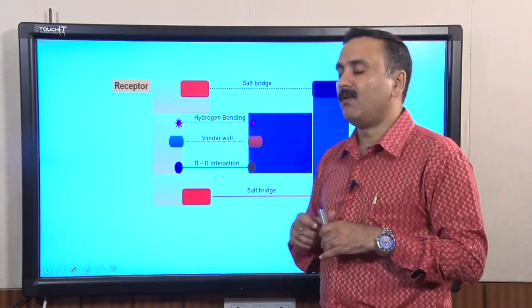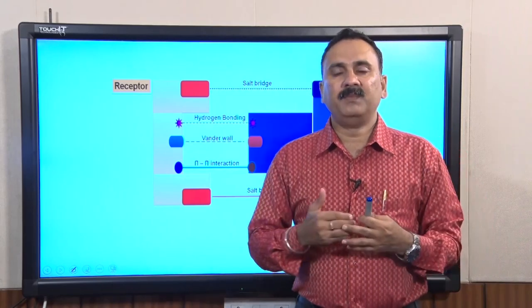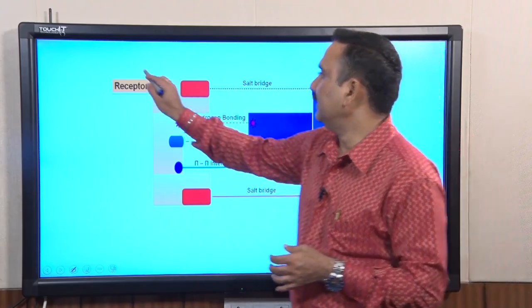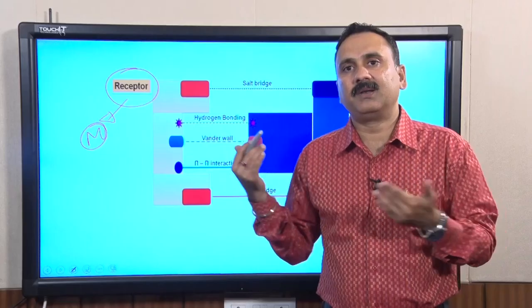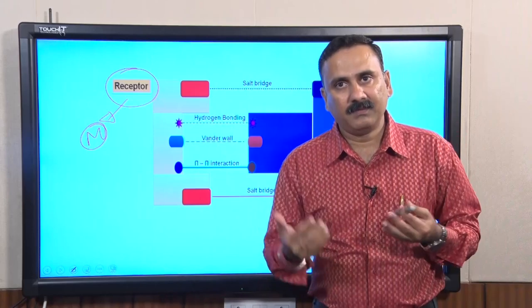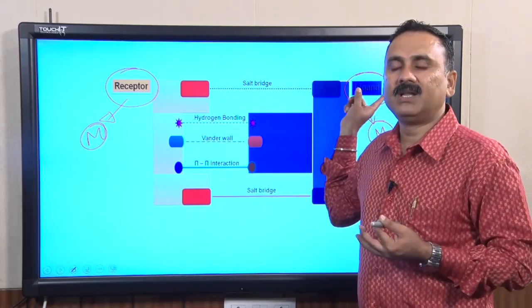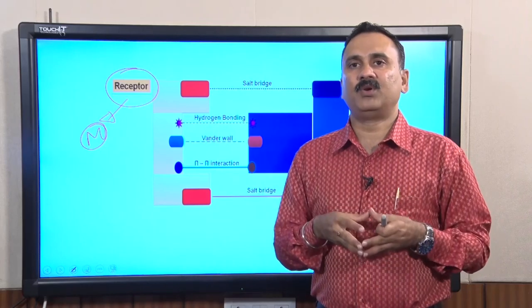So at the end, we have discussed the receptors as well as the ligands. If you would like to perform affinity chromatography, you have to generate the receptors or the ligands, and then depending on the ease of coupling, you have to couple either the receptor or the ligand to the matrix. And then in the second step, suppose you have coupled the receptor, then you are going to produce the protein which contains the ligand. Through recombinant DNA technology, you are going to generate the ligands onto the protein and vice versa, and then you are going to perform the chromatography techniques.